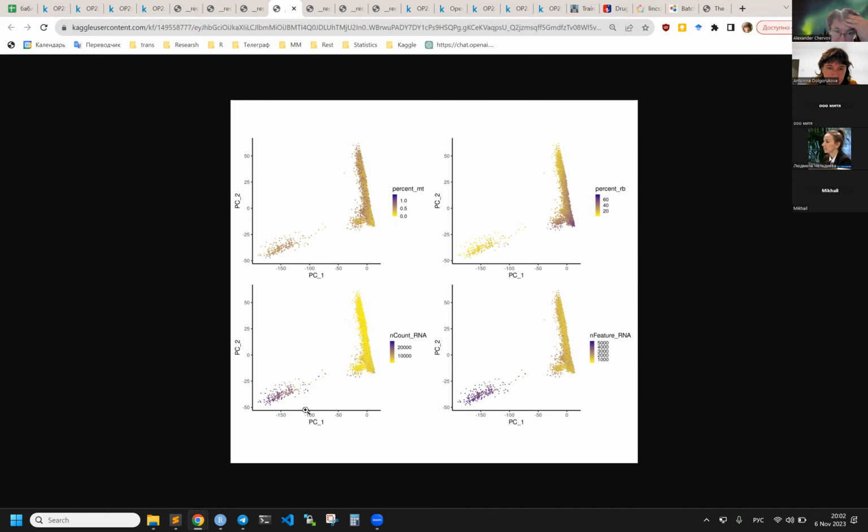But this part is elongated, which is not myeloid cells but this yellow part, and we see a clear direction here. So the question is how we can interpret what's going on here.